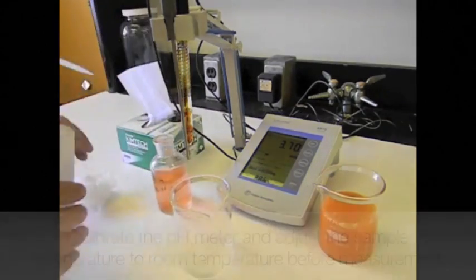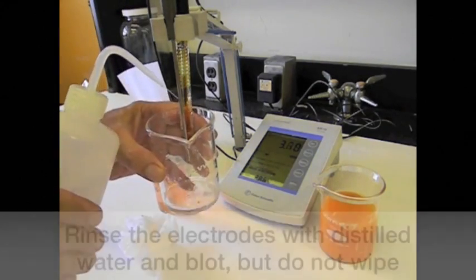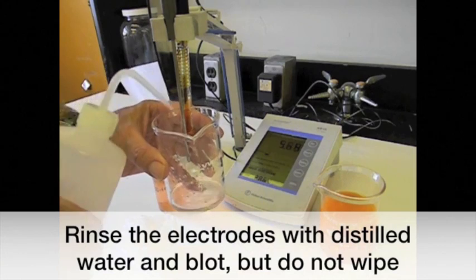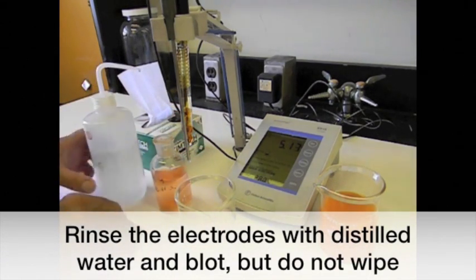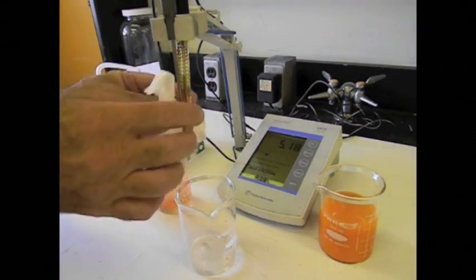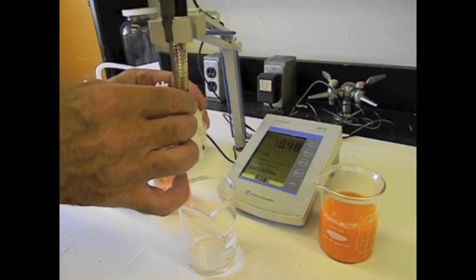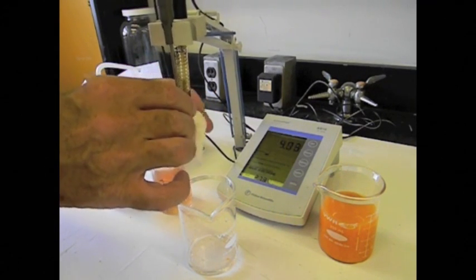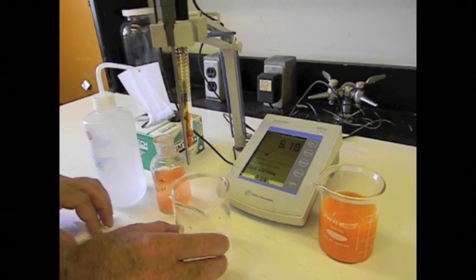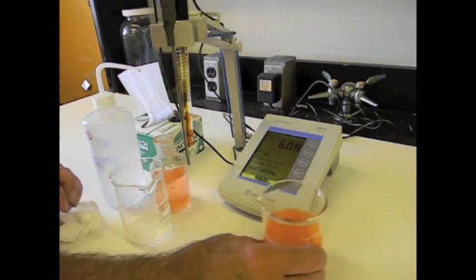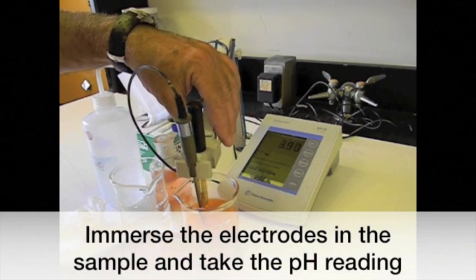Calibrate the pH meter and adjust the sample temperature to room temperature before measurement. Rinse the electrode with distilled water and blot. Do not wipe. Immerse the electrode in the prepared sample and take the pH reading.